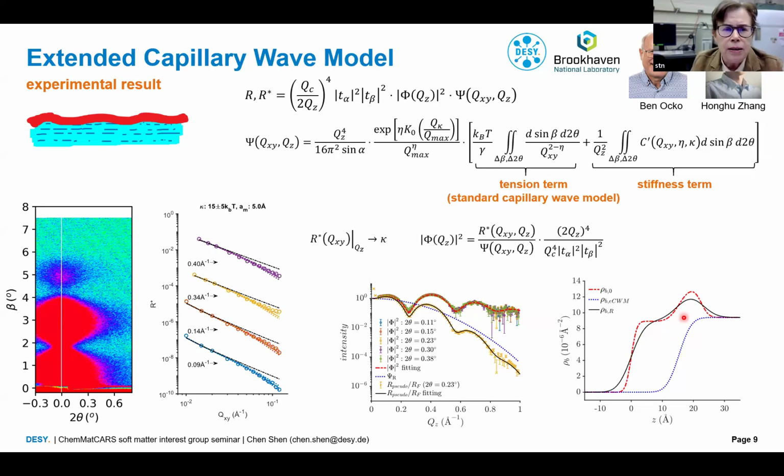Can I ask a question here? So you looked at different distances from the center, from the meridian, and you have different curves corresponding to that. We do a similar thing, but I'm wondering what was your ideal distance from the center to match any literature values of head-to-head spacing, for example? Actually, it's not from the center because it's a monolayer. So we actually measure from the top surface, the air-tail interface, all the way into the water. So one side is air, the other side is water. So this is on the liquid surface.